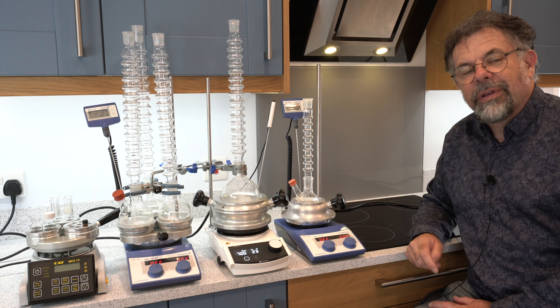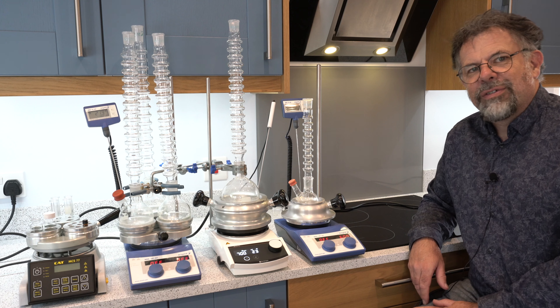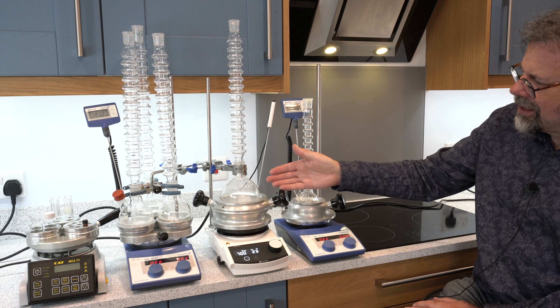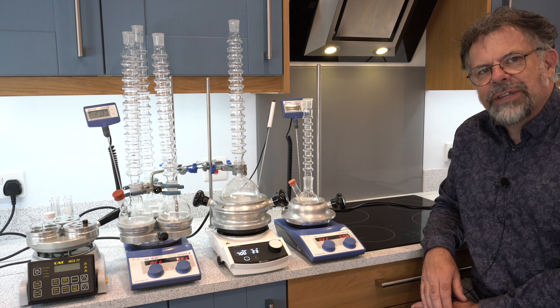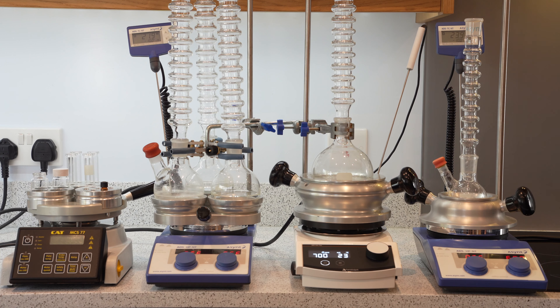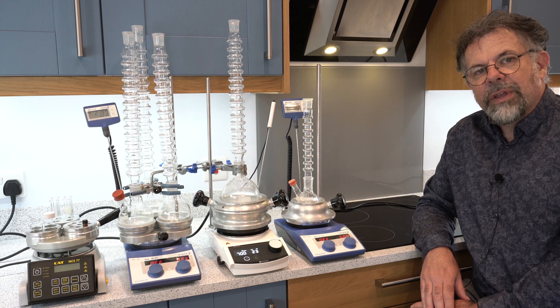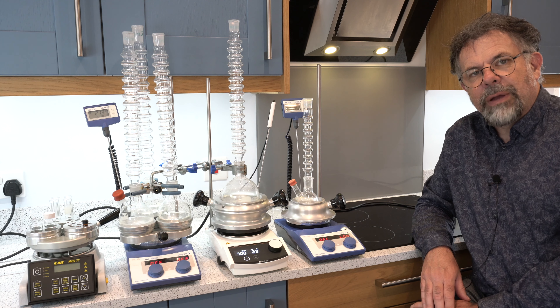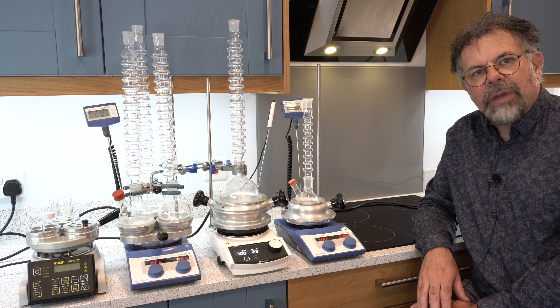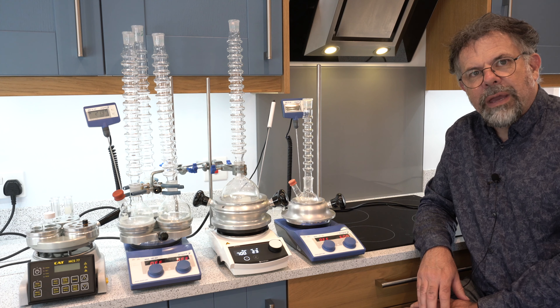Disclaimer: there's no clamp — I've run out of clamps for my demo in the kitchen, so I apologize for that; we're not doing real experiments here. The same goes for the DrySyn Classic — very easy to swap out the inserts. You can buy the Classic as a kit with a set of inserts to go from 50 millilitre round bottom flasks up to the one litre that the main base takes as standard. So a very popular purchase package.